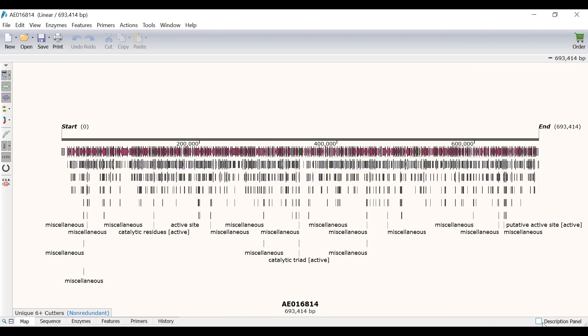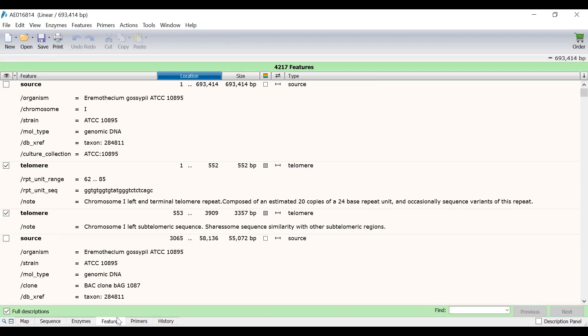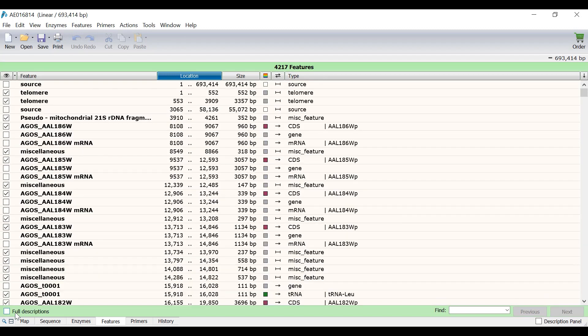Next, I will now go to the Features view to see the list of features in this sequence. And as you can see, there are 4,217 features. Currently, the Features view displays the description of each feature. To view a more condensed version, I will uncheck the Full Descriptions option found in the lower left.